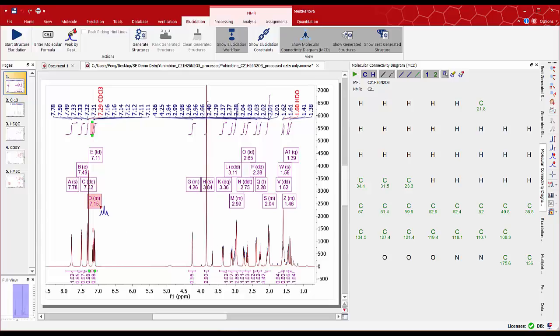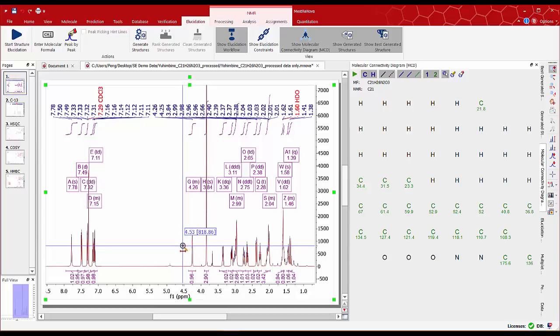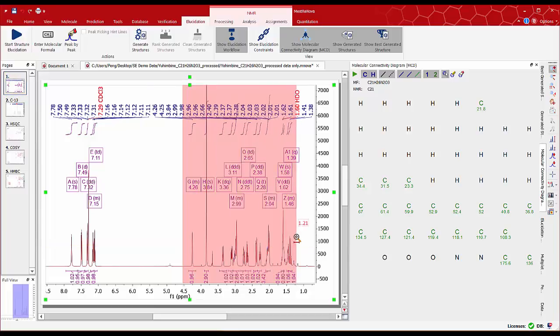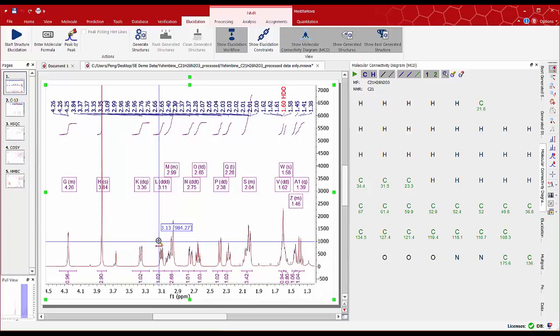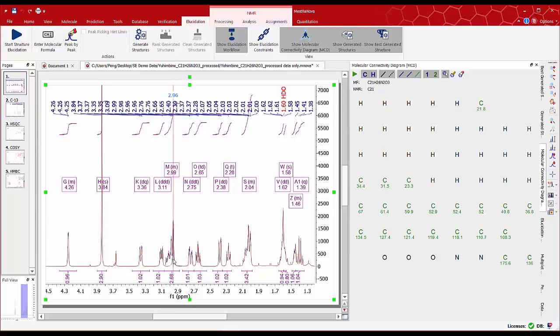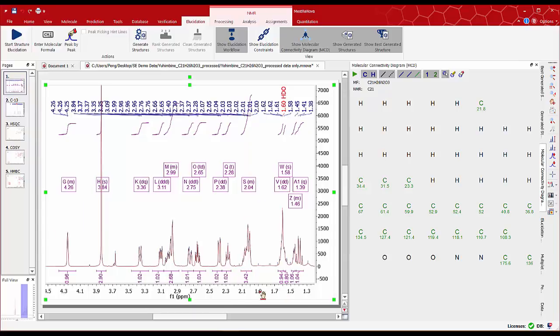Integral values will be very important for the elucidation to know the number of atoms corresponding to each signal. It is important to examine the peak picking and multiplet analysis results. Now we can see some peaks overlapped at around 3 ppm for 2 or 3 protons and also at around 2 ppm we can see a signal with about 3 or 4 peaks.